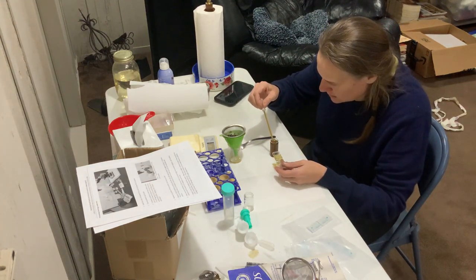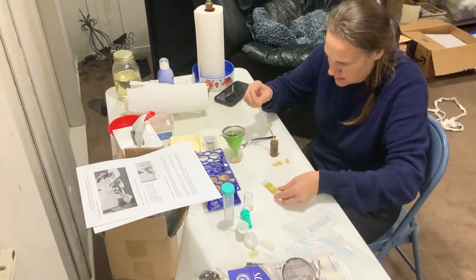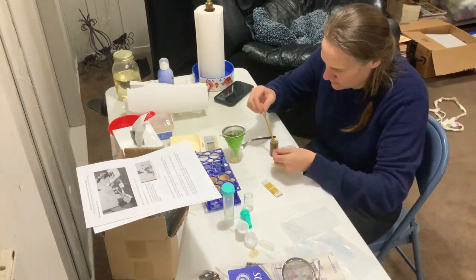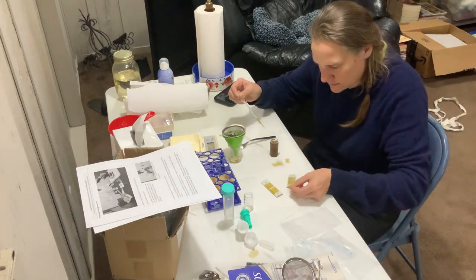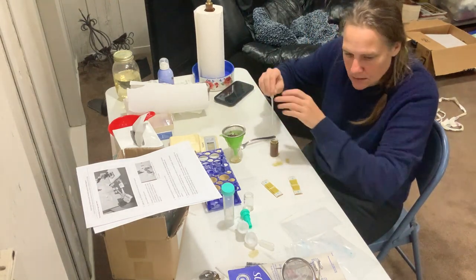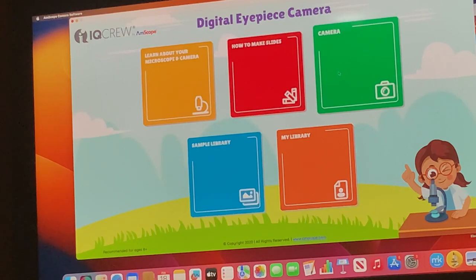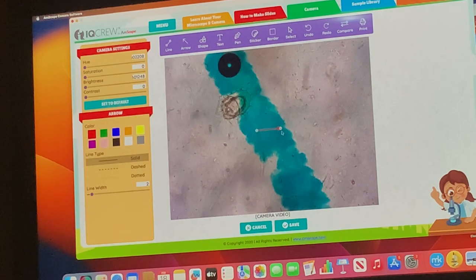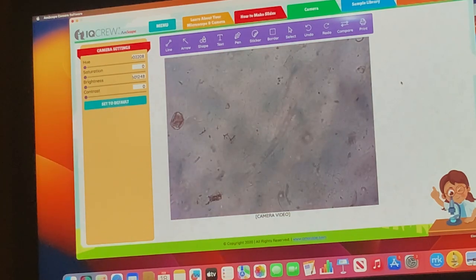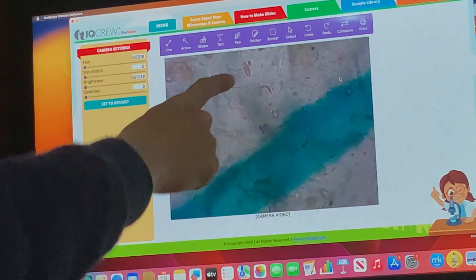Stirred up. Taking it from about the middle here and I'm putting it on what's called the McMaster slide. I think I'm supposed to do two of them. We let that sit for five minutes. The camera isn't working right. There — look at how perfect that came in now. I'm going to do this again. This is the one I'm looking at under here, which is nowhere near where it is in the location in my microscope, but that's okay. It's pretty cool. Okay, here it is right up there — whatever that is that I'm seeing.